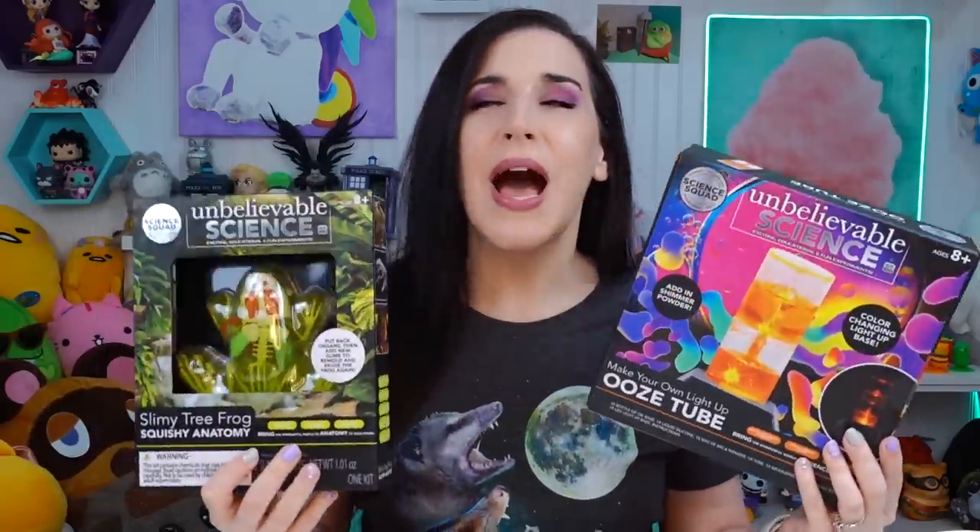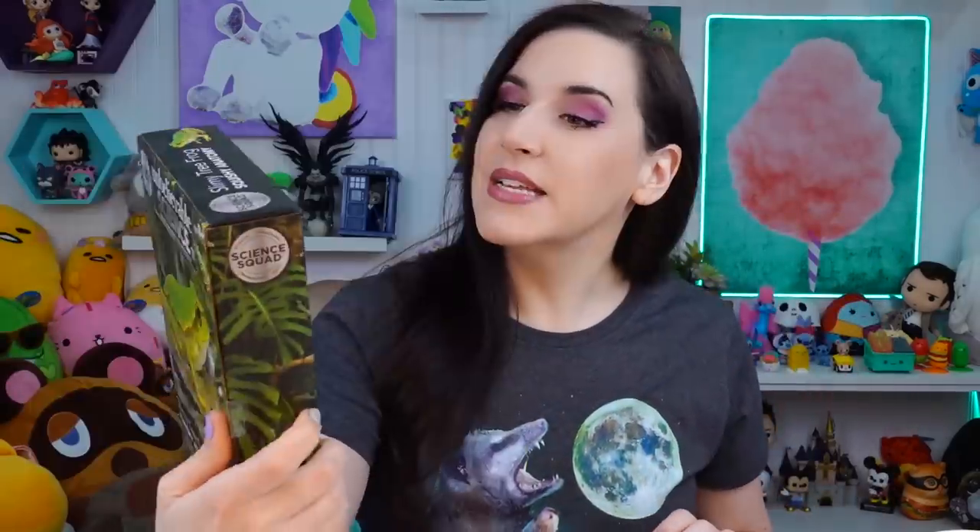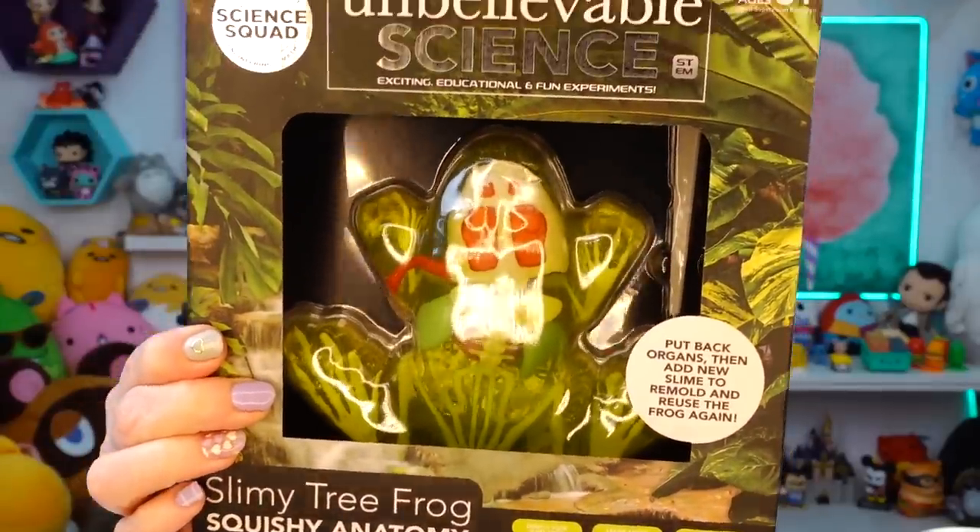I found two different craft kits — count them, two — at Five Below. They just have like this whole wall of kits, so I bought a whole bunch of different things to see if they were worth the money, to see if they work. I found these two; they are Unbelievable Science. This one looks so cool.